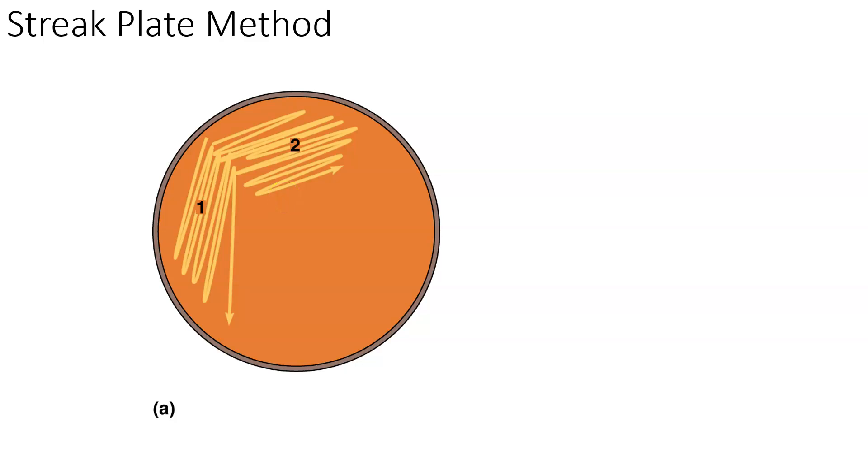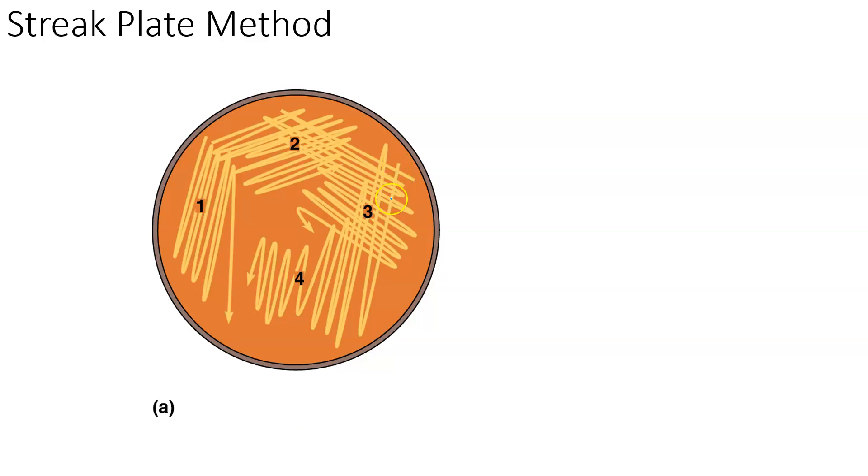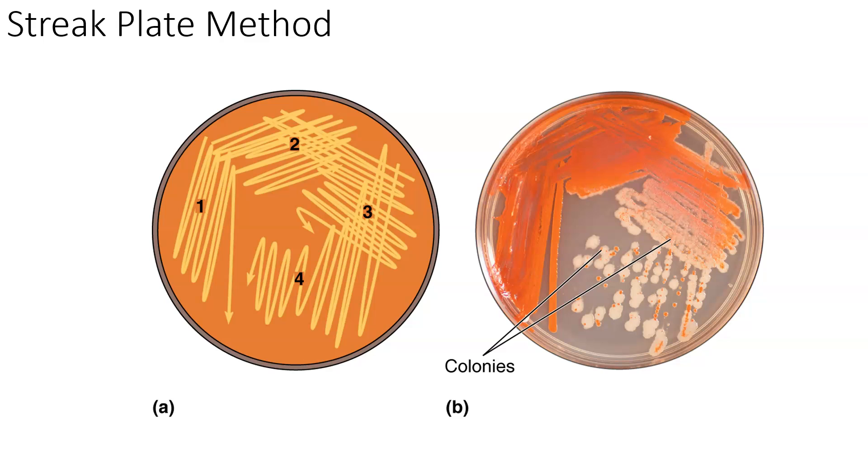You'll then flame your loop, sterilize your loop, you will follow that up by pulling through quadrant two and inoculating quadrant three. That should further deconcentrate this particular solution or sample. You flame your loop and then you pull through quadrant three and inoculate quadrant four. By the time you get done with all four quadrants, after it is allowed to grow for 24 to 48 hours, you should have a sample that allows you to actually see pure cultures.